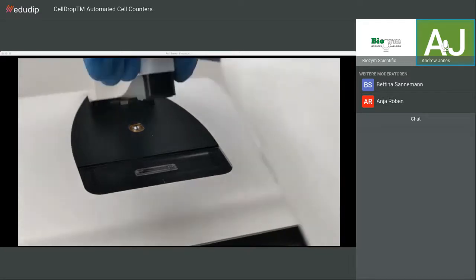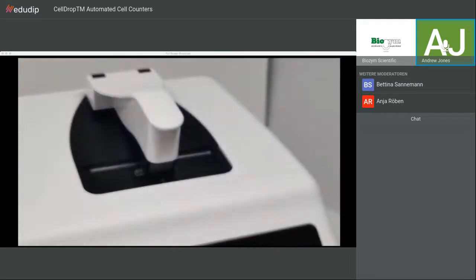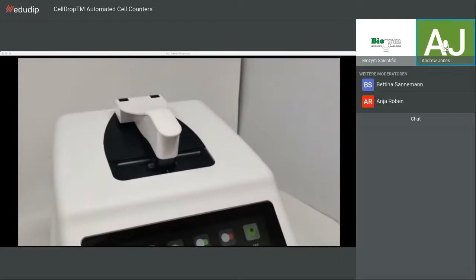If you do use direct pipette for it, you can use bleach to clean it if you like, or ethanol can be pipetted into the chamber, and the surface itself, sapphire, is resistant to all of those sorts of cleaning chemicals. Hopefully that answers it okay.